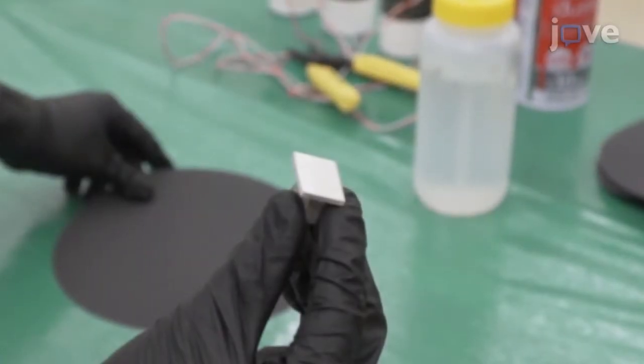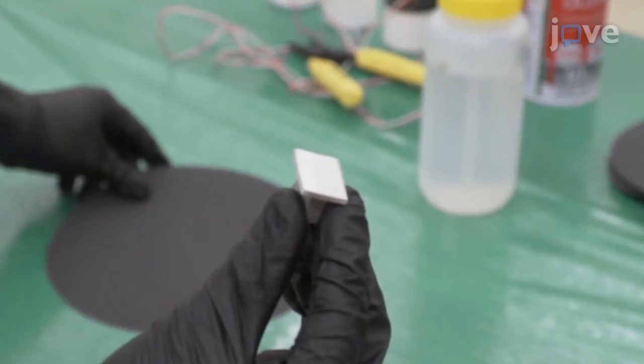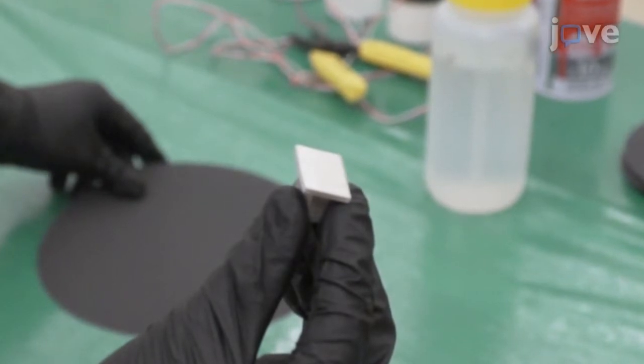Begin by using a computer numerical control machine to cut as-received aluminum 3003 alloys into several 1.5 by 2 square centimeter coupons.